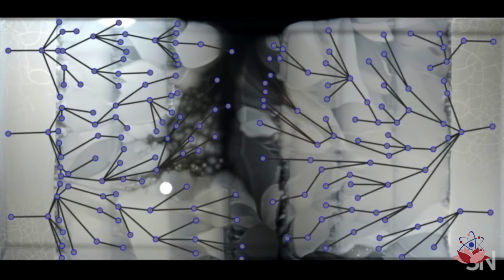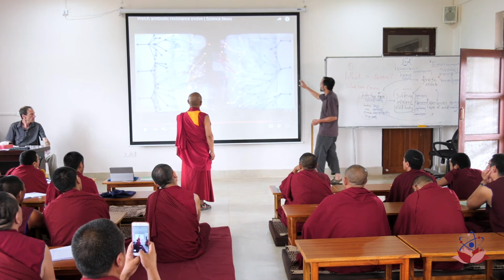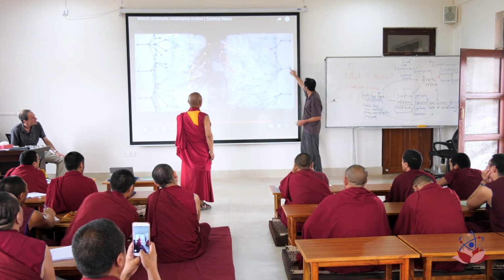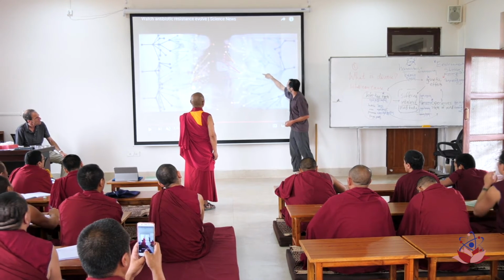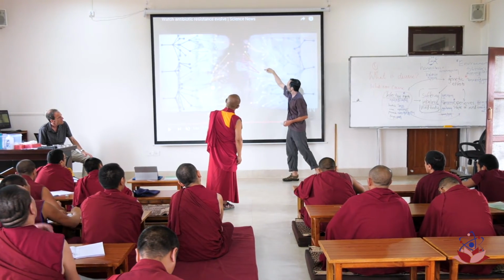That's cool. Okay. So these are, right, pause right there, right? So these are thought to be events where mutations occurred, and then new mutations, new colonies growing out.